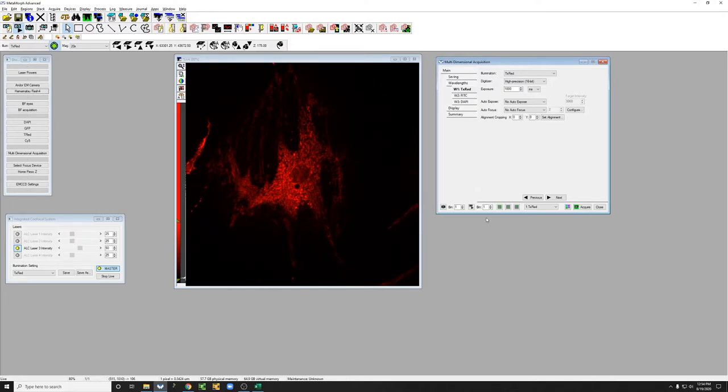One of the things that we can adjust is the binning. So what is the binning? The binning means the following.